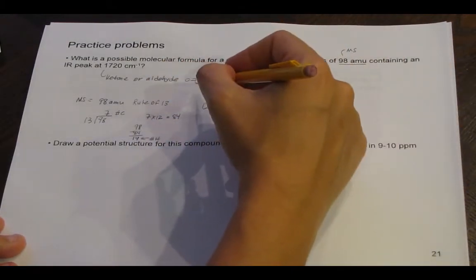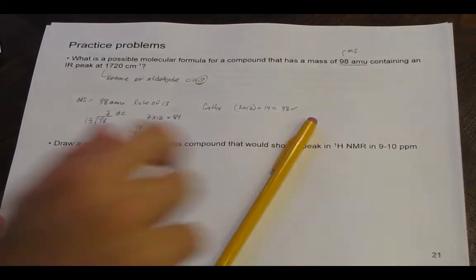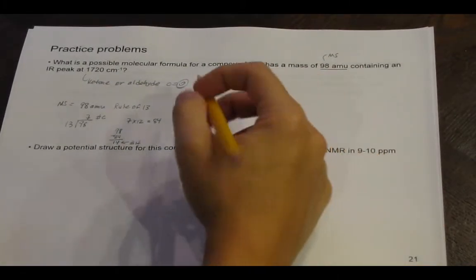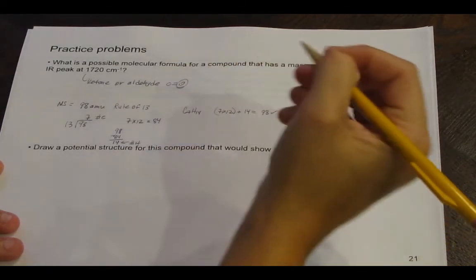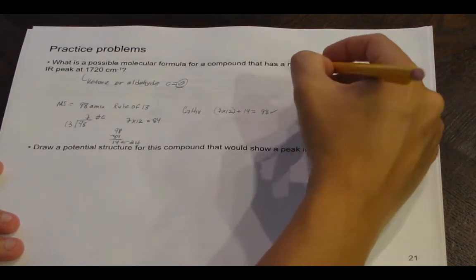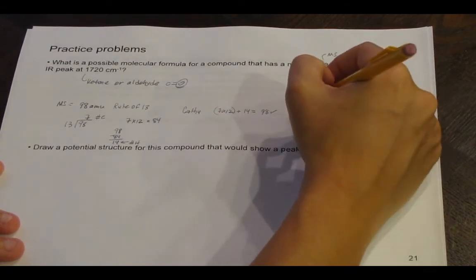And we had mentioned that we wanted to add oxygen to this formula. We need to add oxygen in because the IR told us we had a peak at 1720. So to do that, you have to know what CH equivalents oxygen is worth. Oxygen weighs 16, so that's a CH4 group.